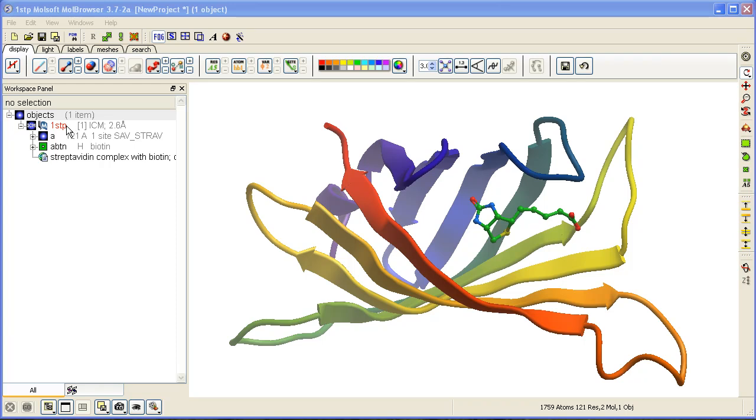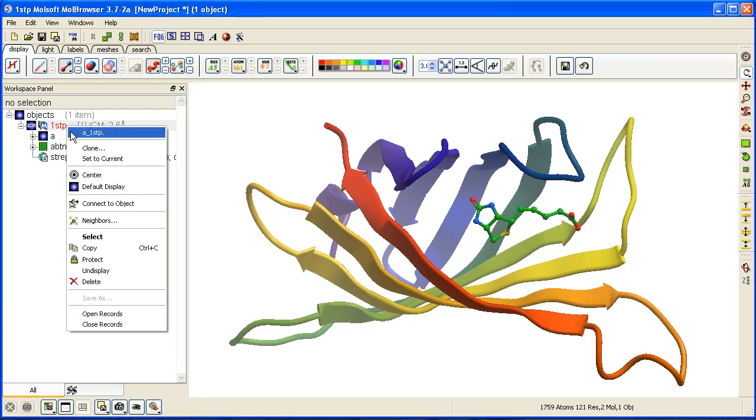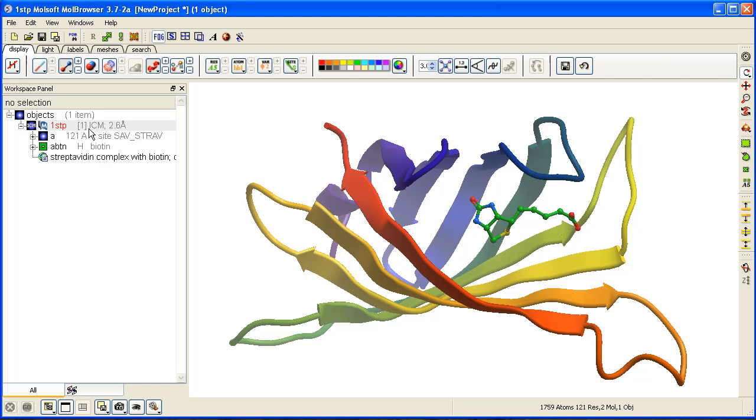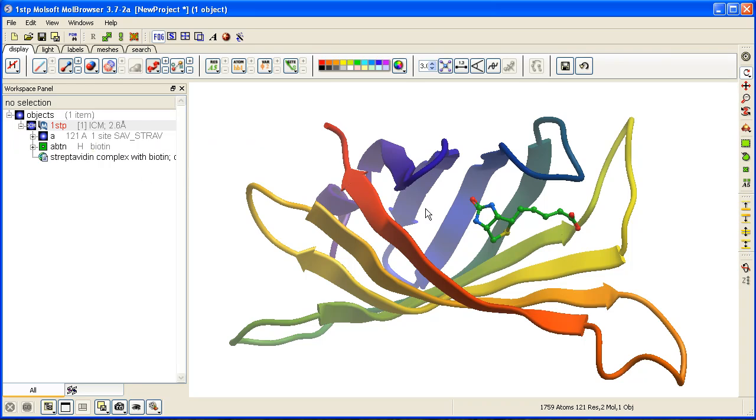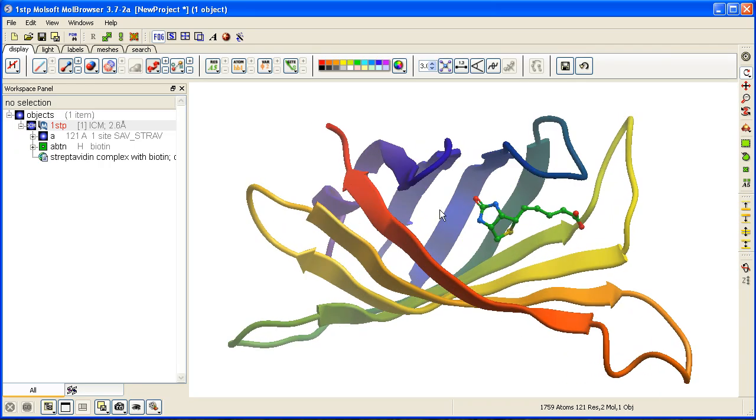You can right-click and select convert to ICM object. The aim here is to display the hydrogen bonds surrounding the biotin molecule. To do that, we need to display the residues surrounding the biotin molecule.